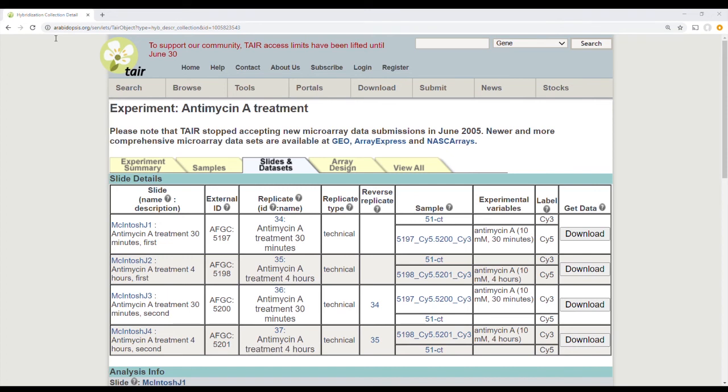If we look at AT2G36880, I see a fold change of 1.105. Below that, I'm looking at locus AT3G50370. I see a fold change of negative 1.038. Now, when I look at those numbers, well, that tells me that some are upregulated and some are downregulated.